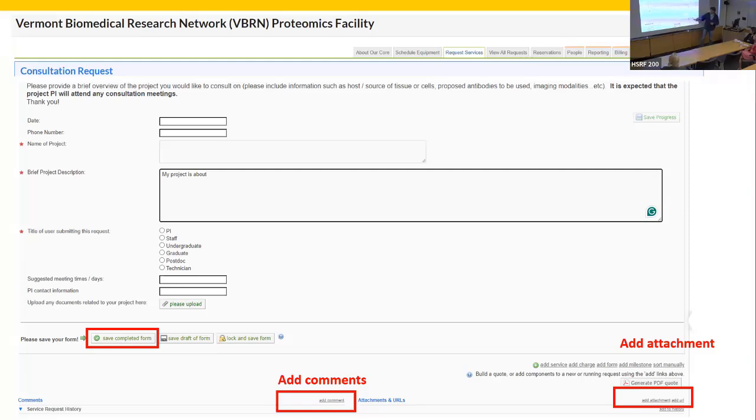So it turns out that we will keep everything in iLab. It is relatively easy for us and for the PI to go back, according to the iLab number in the lab notebook, to check all the work we have done for you and for the lab members.